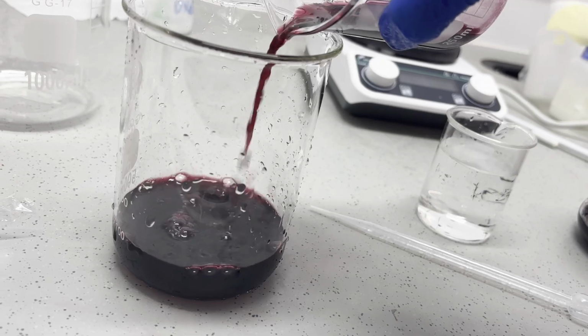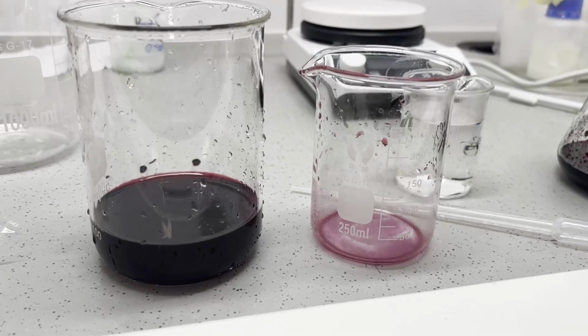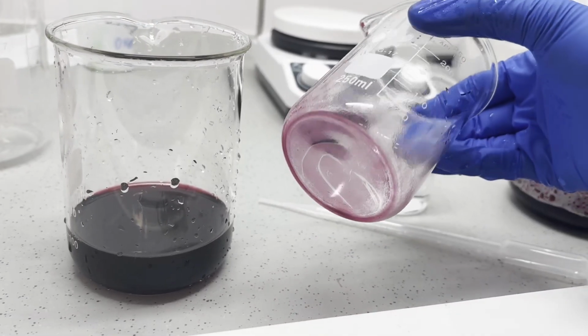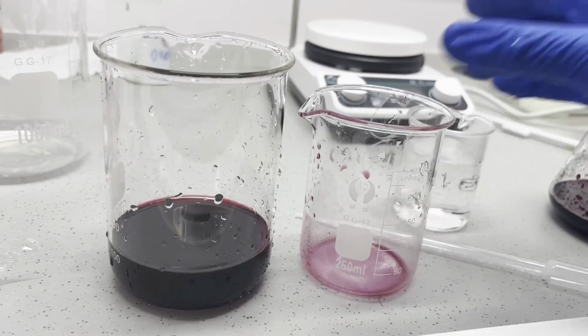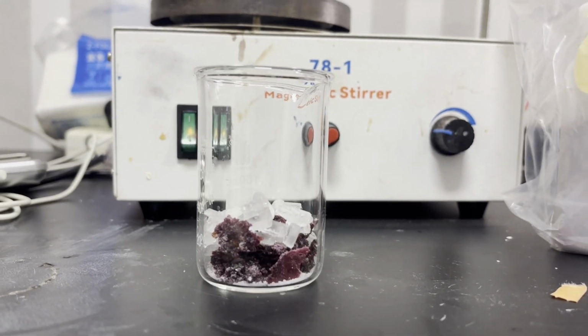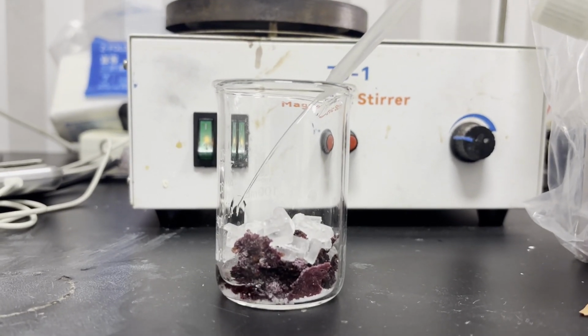This failure hurts a lot since I used up a lot of chemicals, and the carbonate complex is a key starting material of other complexes that I plan to do. For example, adding acetic acid to it would easily afford the acetate complex. But anyways, I proceeded to one of my remaining choices, the thiosulfate complex.